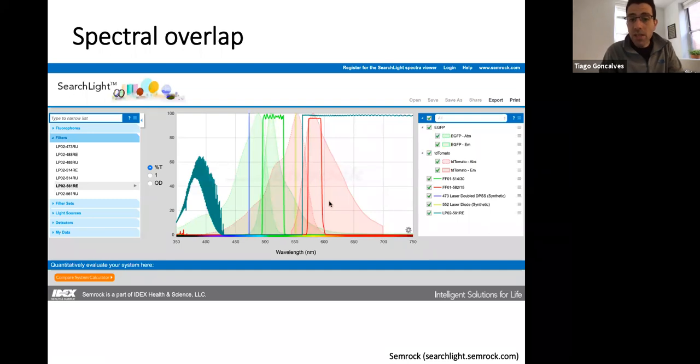And remember, your excitation light is usually a lot stronger. It's a laser. It's a lot stronger than your emission light from your fluorophore. So you have these emission filters. And here the emission filters are this light green and the bright red here. So these are the 514/30 and 582/15. Do you guys know what this means? What does this mean, 514/30?